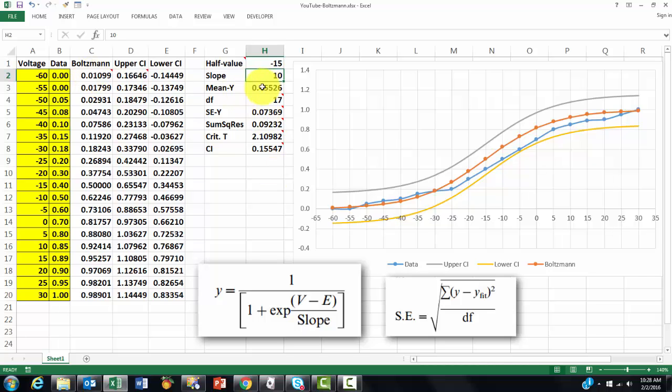Then we calculate the mean y, which is just the average function of all the column b values. The degrees of freedom is count all the b values minus the count of a1 through h2, which is the number of parameters we use, these two. So those are the degrees of freedom.